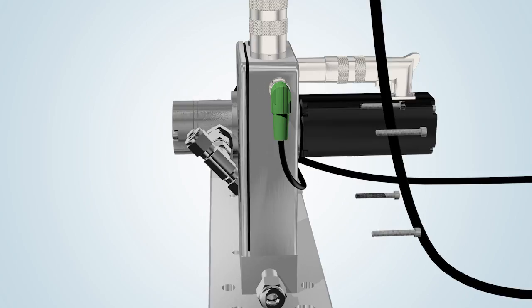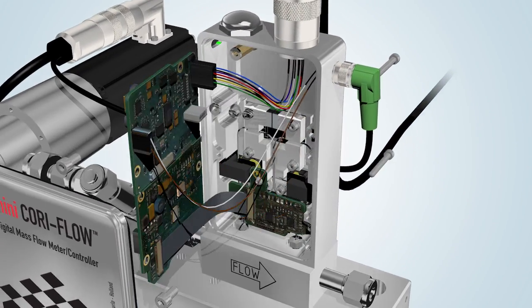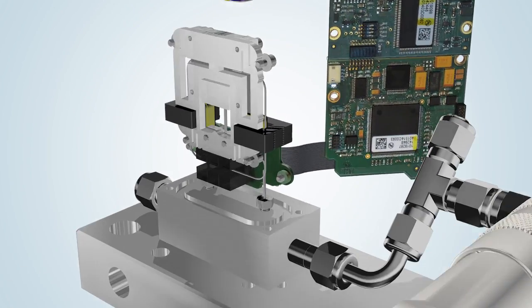Inside the robust Mini CoriFlow housing are the digital electronics, optical sensor, and sensor tube. The internal diameter of the sensor ranges from 0.25 mm to 3.1 mm.